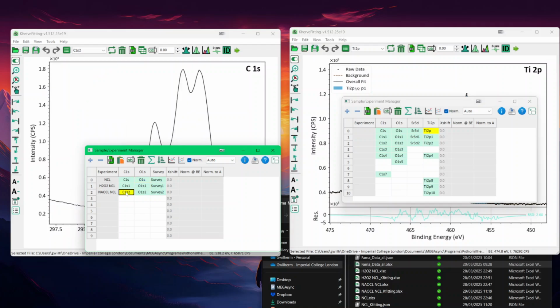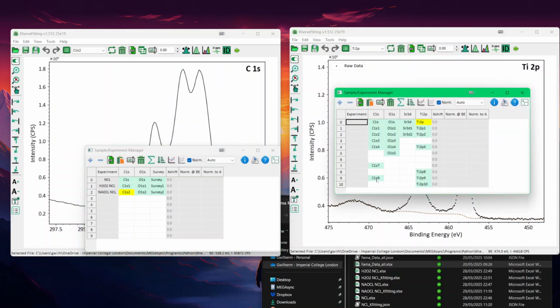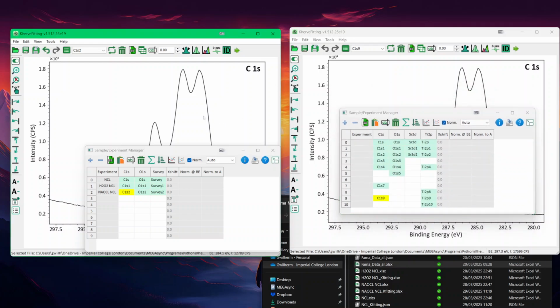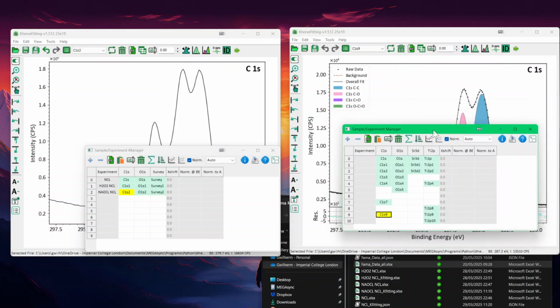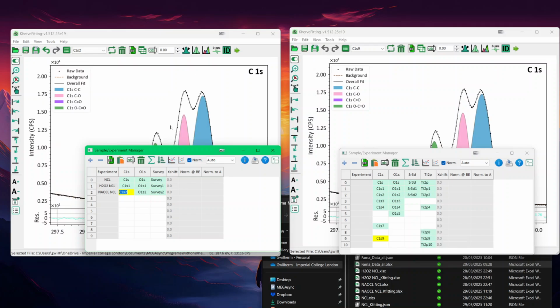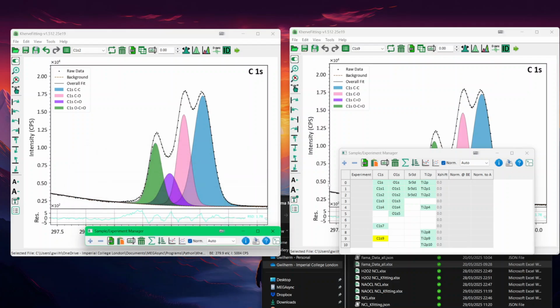Let's say if I go into this one here, I could copy the core level. This is carbon 1s2. But if I go into 9 in here and I can paste, I should get, and it's updating right now, and you see it's carbon 1s9. And that is now this peak. When I just press it, it doesn't show the peak fitting. But if I press this, then you can see the peak fitting that was made. So again, this was the peak fitting that was made here. And if I show you like that, you can see this.